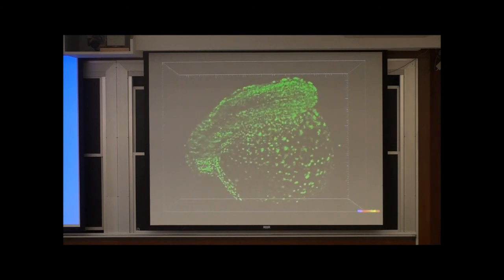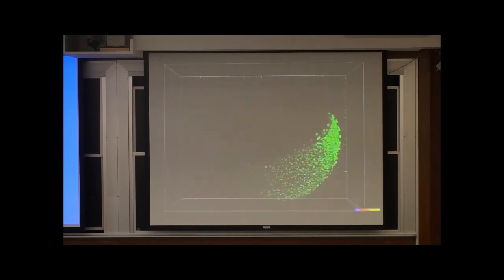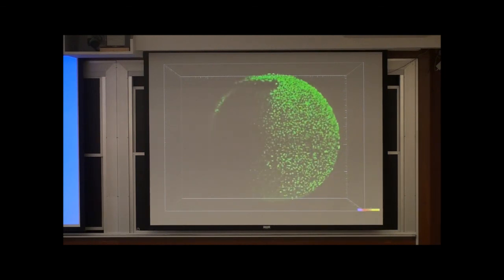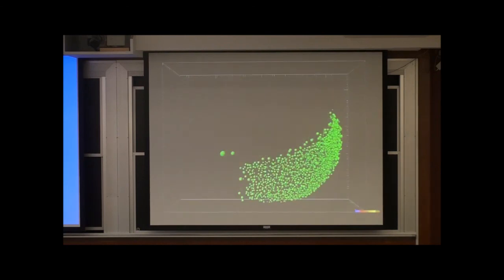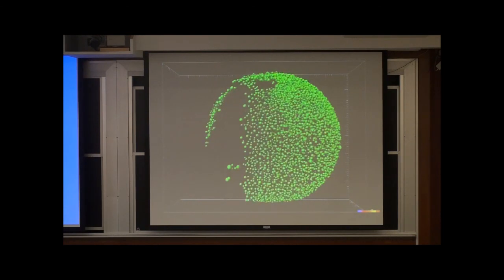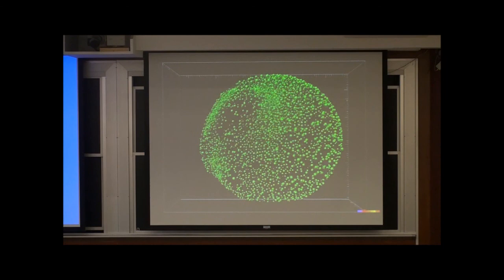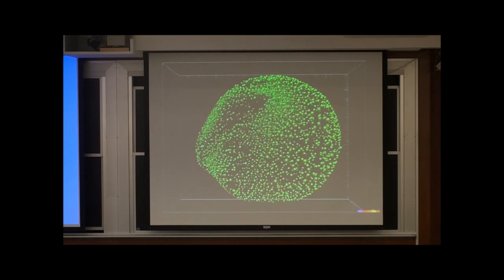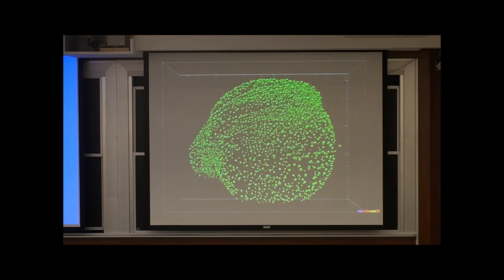This imaging is around 600 to 700 image stacks, imaged continuously for around 12 or 14 hours. We can also do the quantitative biology I mentioned. You can track those cells, you can find the coordinates of each of them, and you can see the tissue kinematics of how each of the cells moves in a coordinated manner.